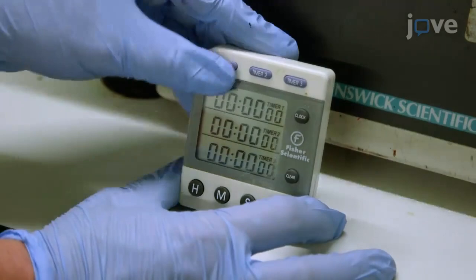Take samples of the culture at regular intervals to the end of the time course. Add each sample to one of the prepared centrifuge tubes.